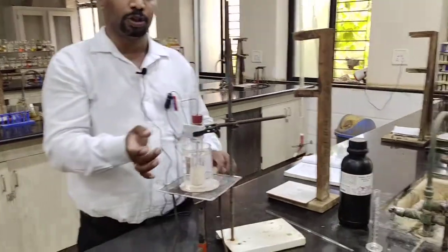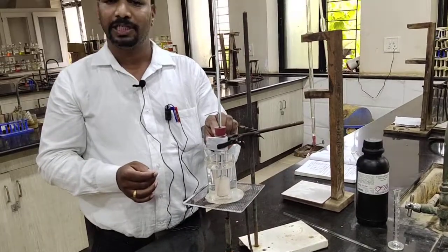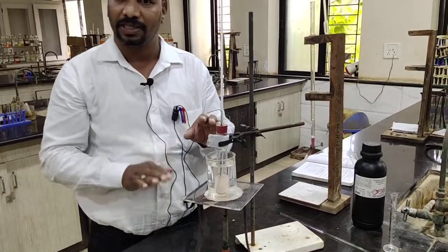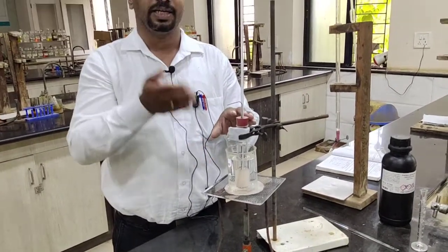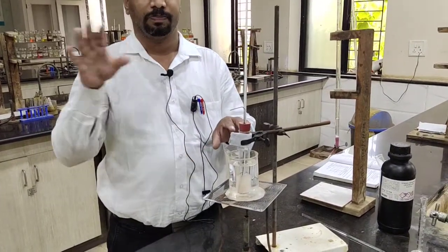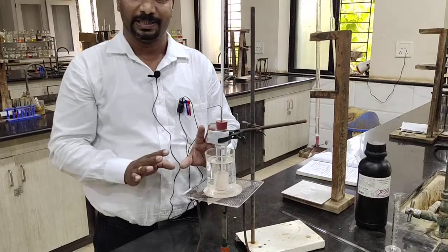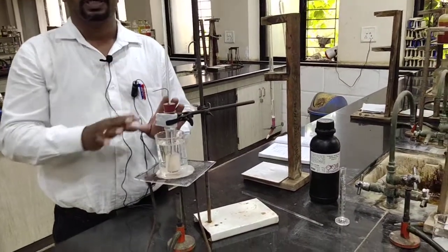Then throw this solution in a basin and take 5 gram of phenol, that means 4.8 ml of phenol, with 10 ml of water, so that we again decrease the percentage of phenol. This we do as a second set. Then similarly do this for 10 ml of water and 15 ml of water, find out the percentage of phenol and percentage of water, then take 2.5 gram of phenol. Similarly do the same experiment.